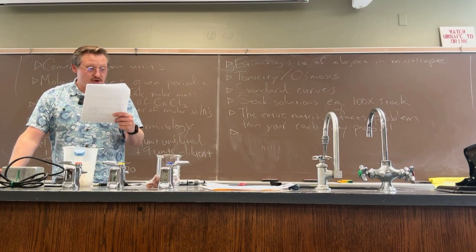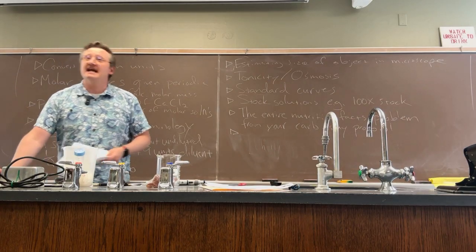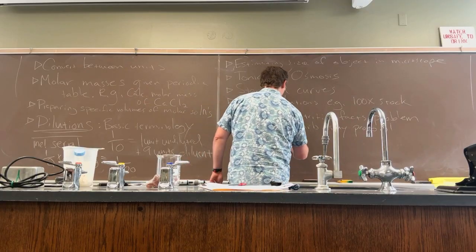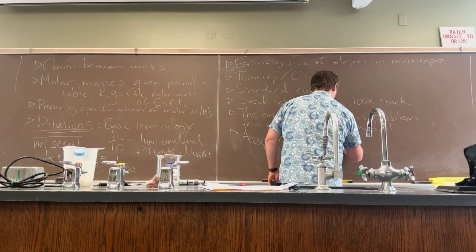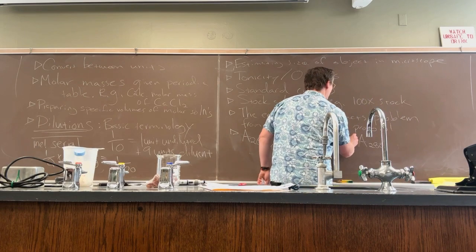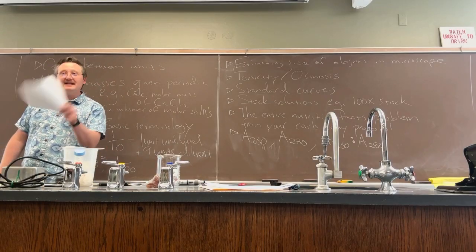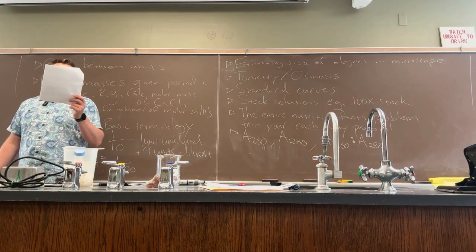We've got 2 questions that have to do with today's lab, DNA extraction lab, okay? It's going to be A260, A280, A260 to A280 ratios. The colon means ratios. All right, cool. Don't worry, we're going to cover all that in today's lab, but just make sure that you pay attention to that aspect.